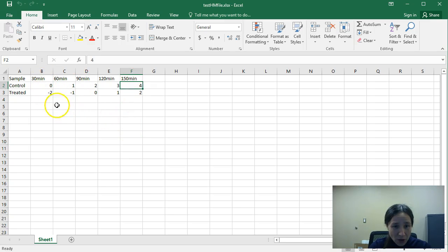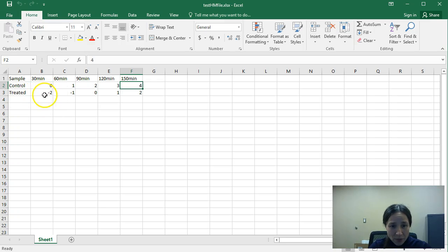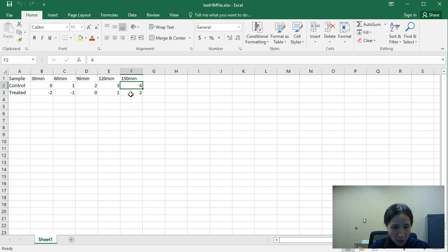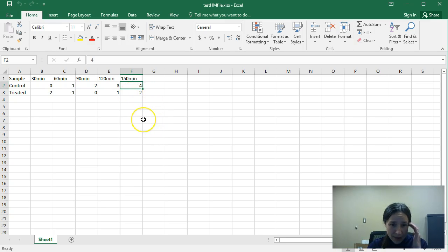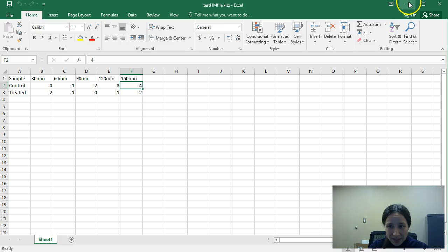so 30 minutes through 150 minutes. You'll notice the control has a nice linear value, 0 all the way to 4, whereas the treated starts at a negative 2 value and then linearly goes up by 1 to a positive 2. So we're going to take a look at not only how to make the heat map but also the changes that can be done to the heat map based on the data set.